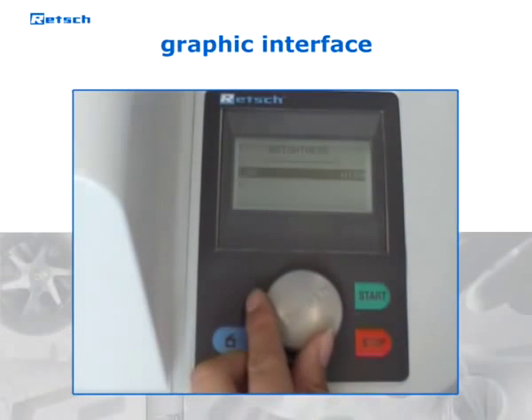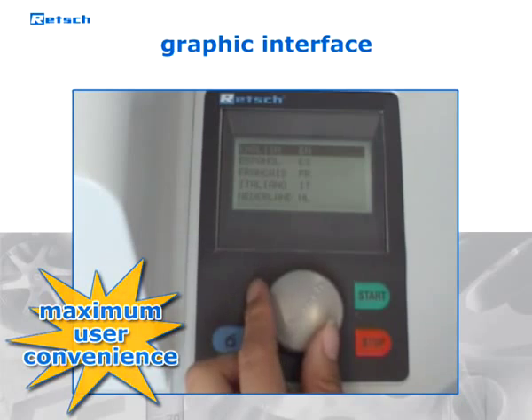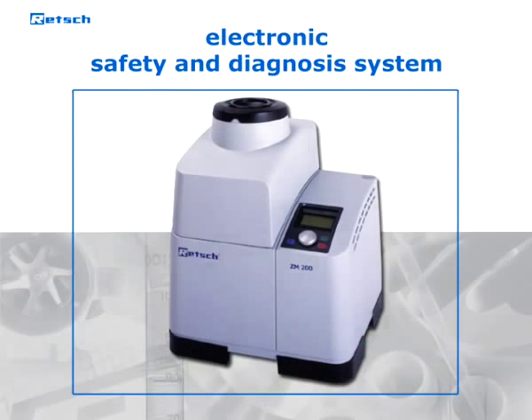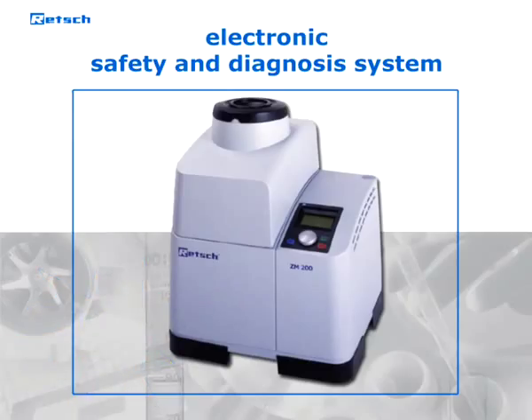The graphic interface and single-button operation of the ZM200 allow easy parameter setting. The display features the world's major languages. An electronic safety and diagnosis system virtually rules out operator errors that might lead to leakage or overheating of the sample. If the machine detects operator errors, a start of the grinding process will be denied.